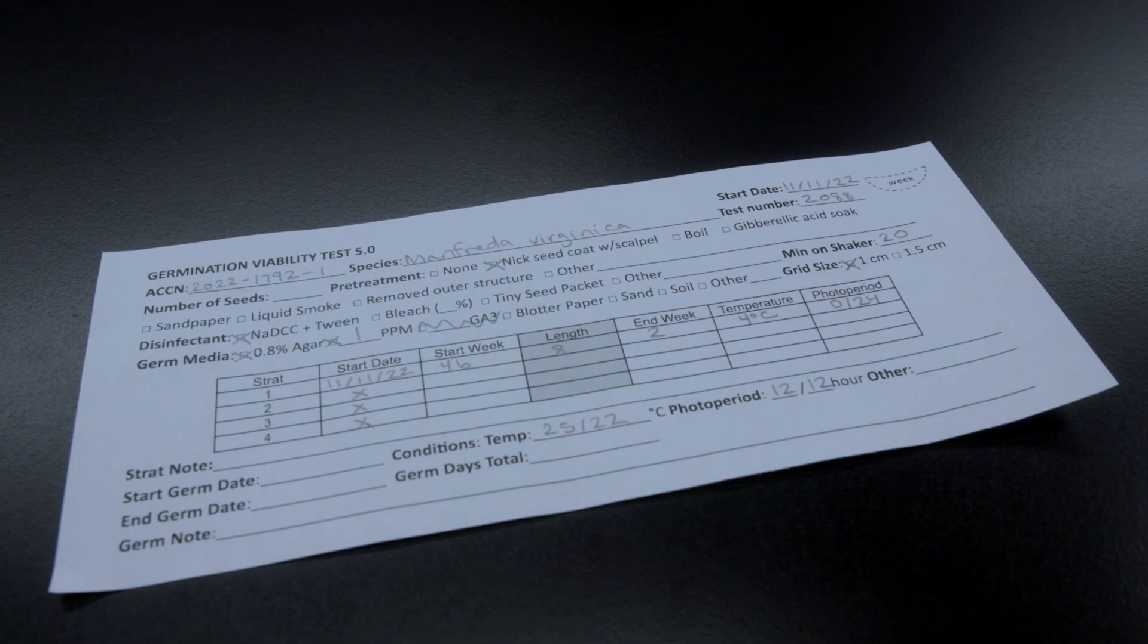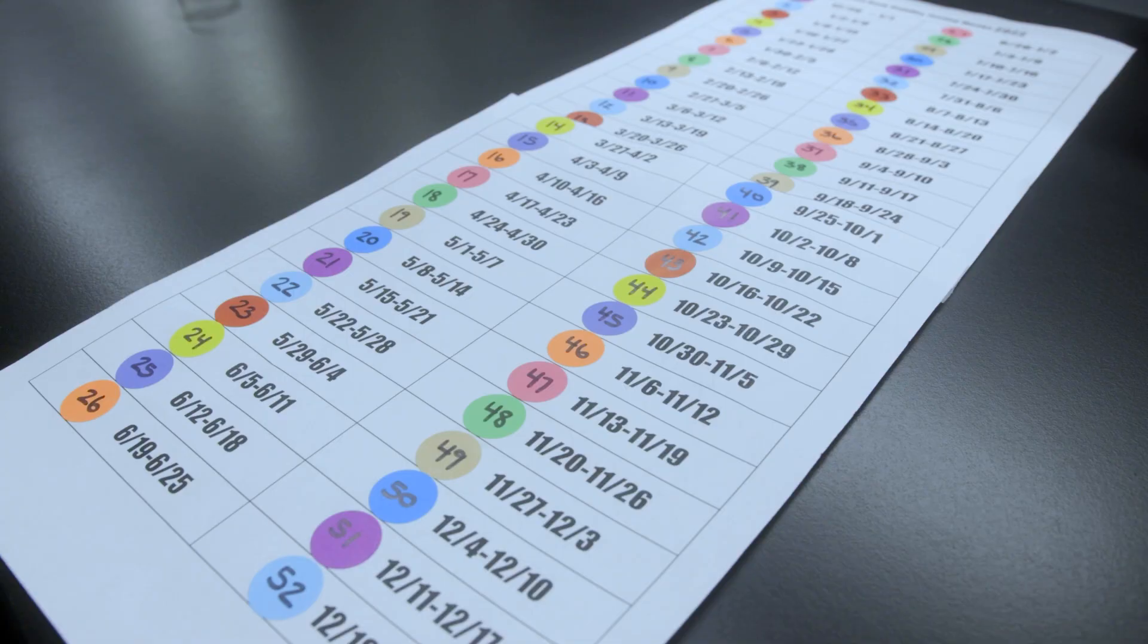Any stratification treatments that the seed might require to break dormancy, I list in the table. We use a 52-week sticker system, which helps us to visually tell when seeds need to move to a different temperature. You can see every week has a different color, so all the weeks ending in 8 are in green, 6 is in orange, and so on.